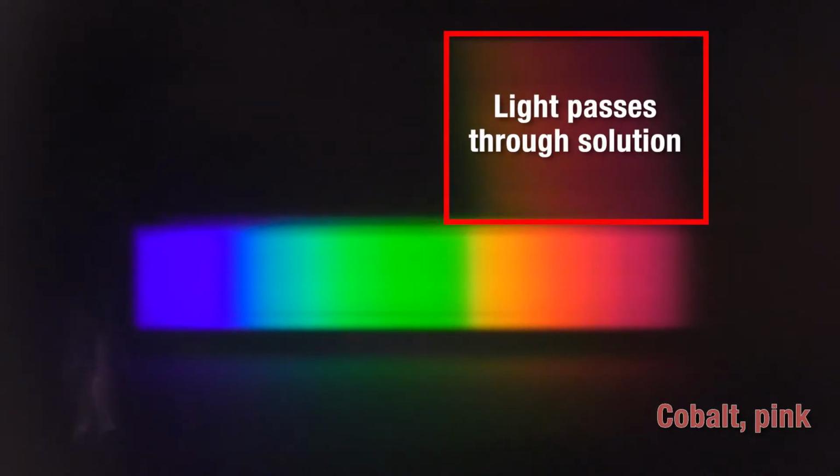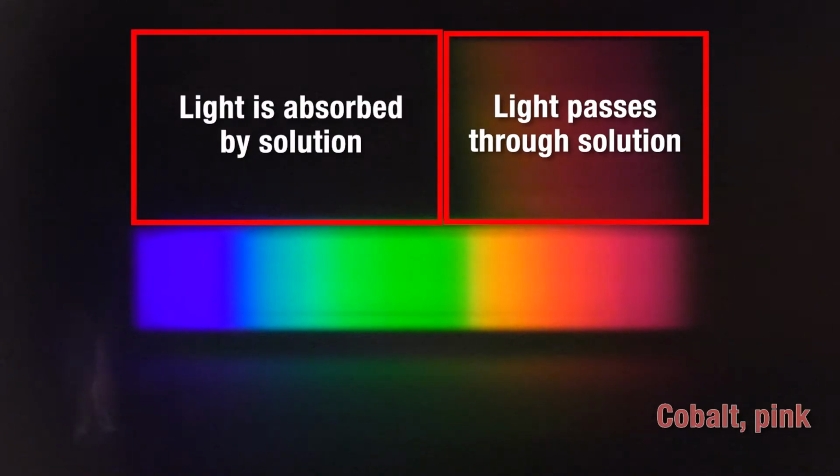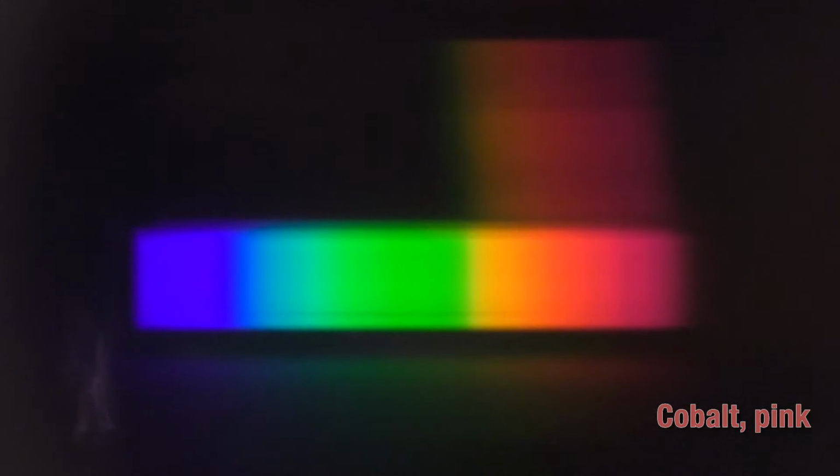First we're going to put in cobalt. Now here comes a vial of cobalt. What you can see, hopefully, is that we still see red coming through, but you can notice that all the way from green down to blue, it's completely blocked out. The conclusion there is that cobalt is absorbing all the wavelengths of light from blue all the way up through kind of a greenish yellow, but it's passing through the red and kind of pinkish colors, and so of course that's why it looks pink.